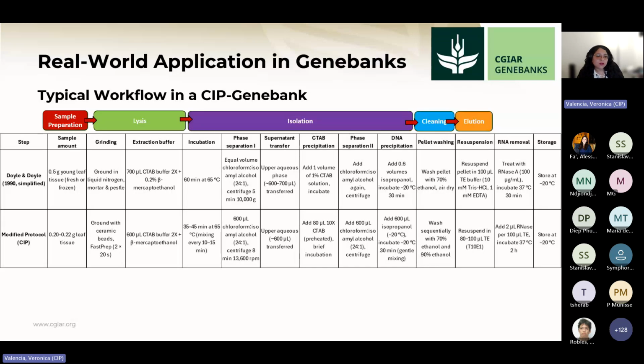So you can always start with Doyle and Doyle if you want to try it, but it's very common to have 2 washes and 2 chloroform phases.